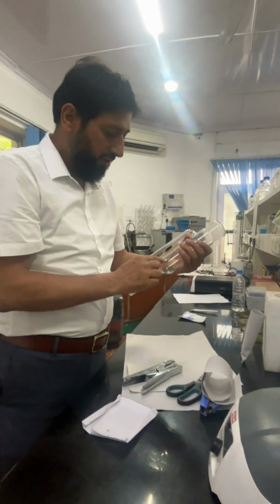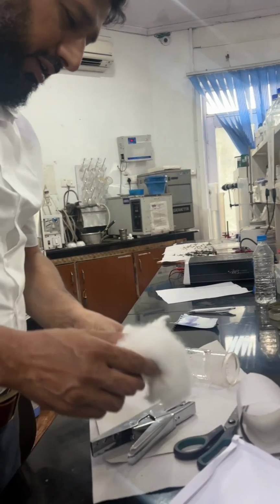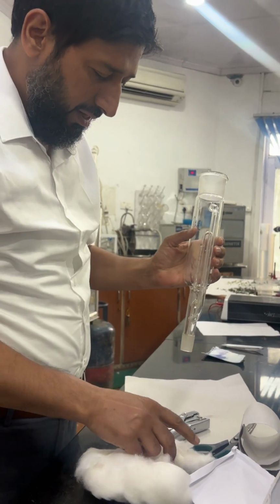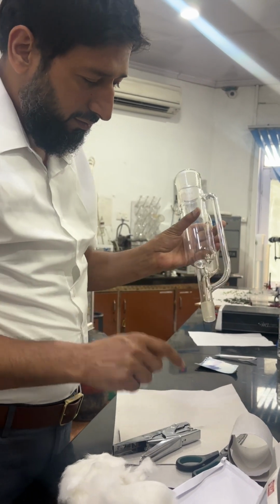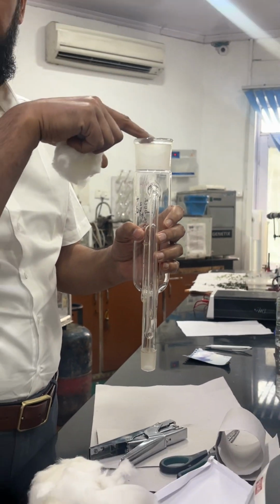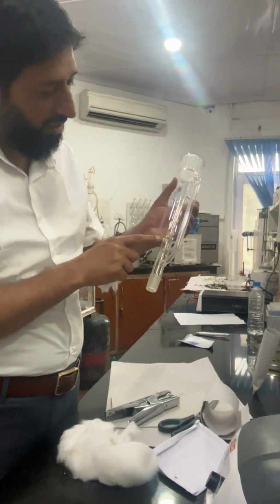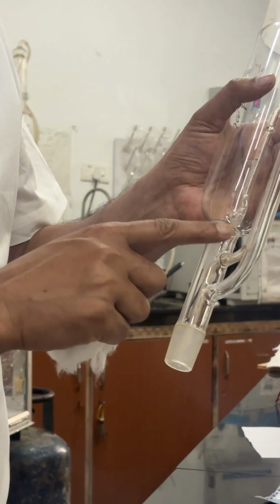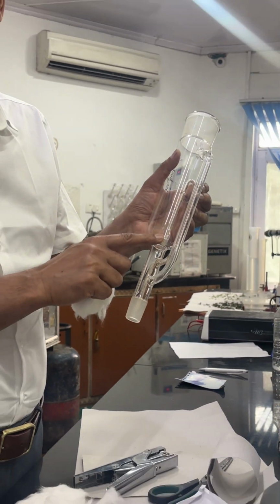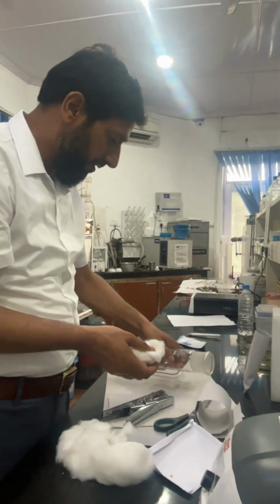First we require some cotton. What happens sometimes if we do not use cotton, some of the material comes out of the thimble while we are running it and goes in here and it blocks this exit here, exit 2 here. So we need to see that we don't block this. That's why we put some cotton in there.